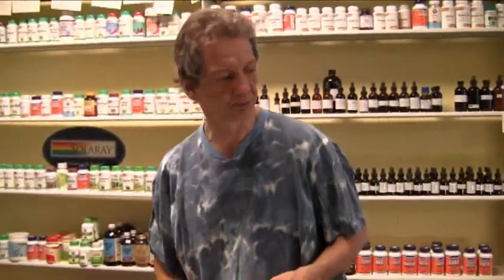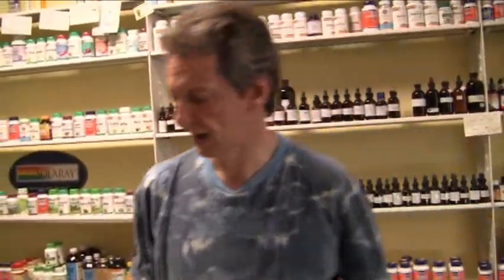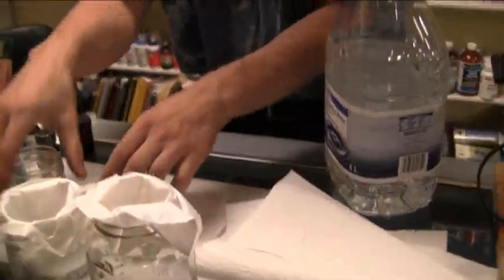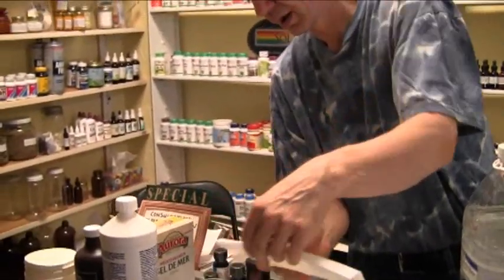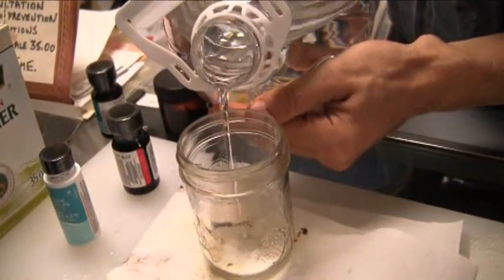We're measuring it off. Give me a second, because I've got to follow this — I've only done this once or twice and I want to make sure you guys get it right. We're going to add a little water to it — not very much, just enough to cover it, basically.